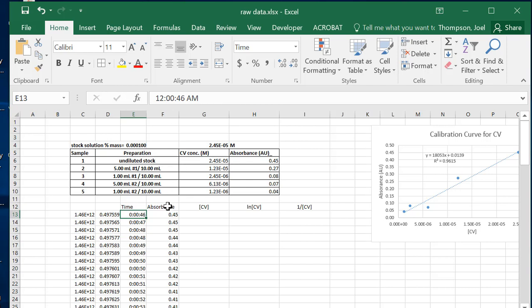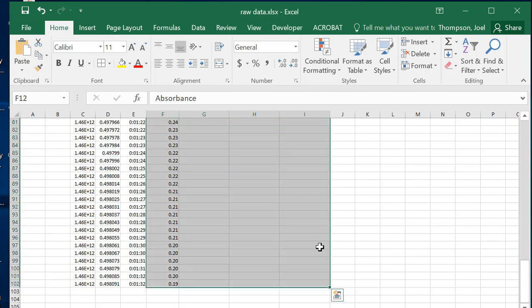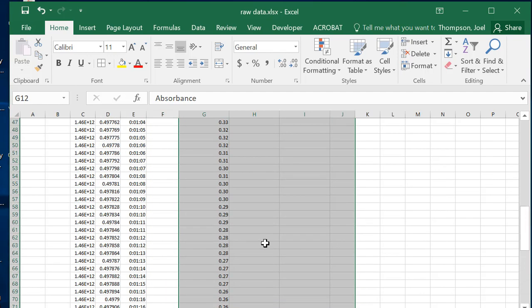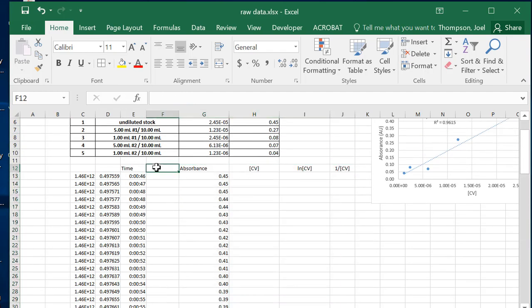So what I'd like to do is read elapsed time. Again, I'm going to let my Excel spreadsheet do all the work. I'm going to move all this over a little bit so I have a little room to work, and you're going to see what I'm doing here. Just highlight that, move it just one over so I have a place to work on time. So why don't I put in here elapsed time? Or I could call it time, but I'm going to record it in seconds.